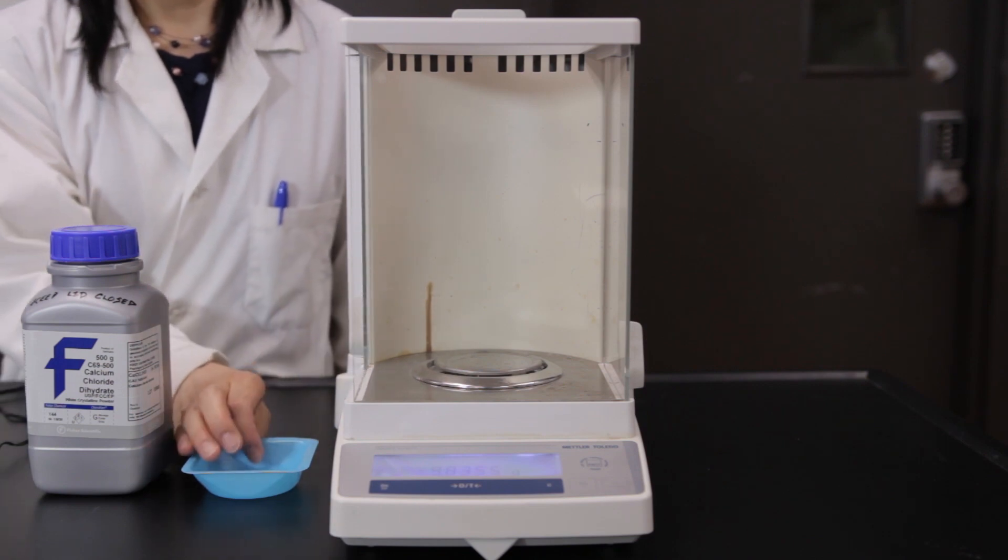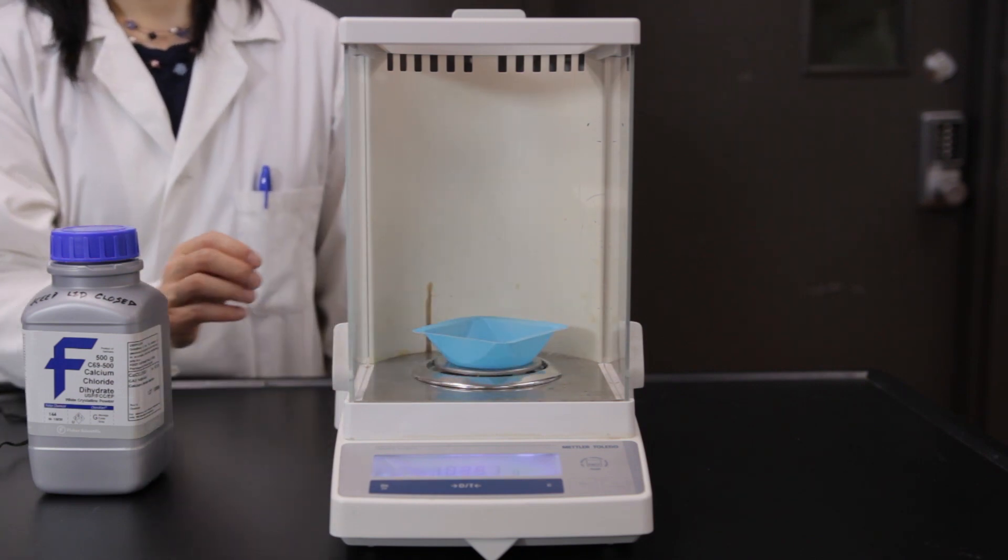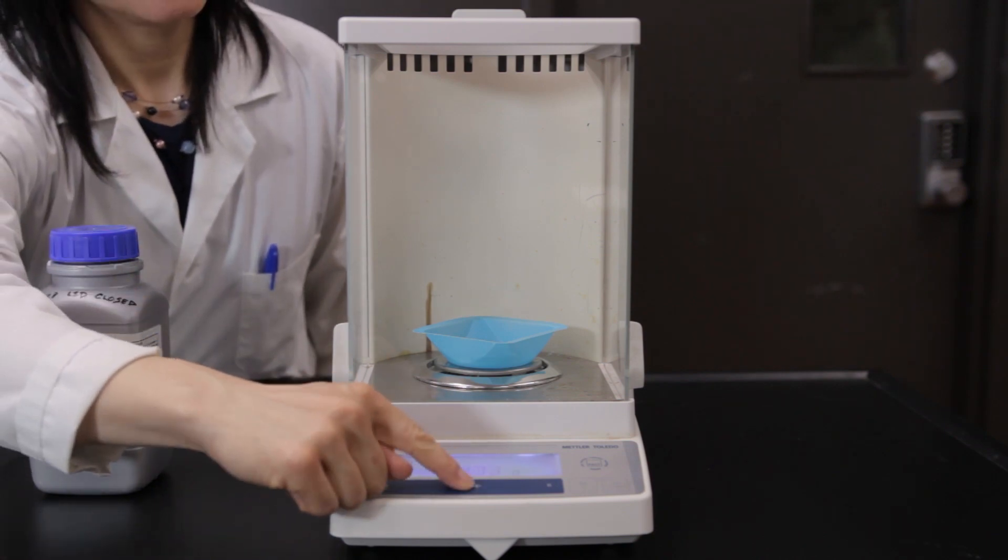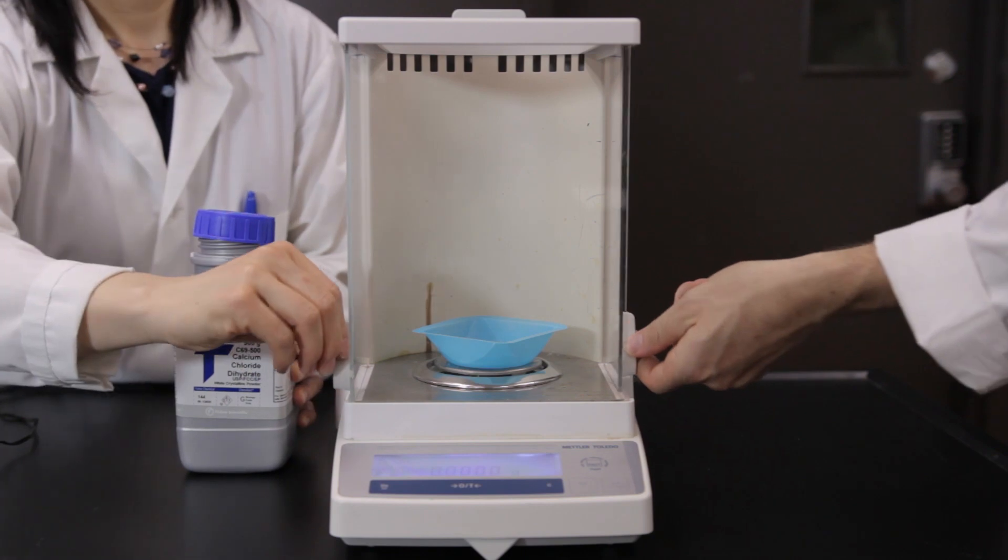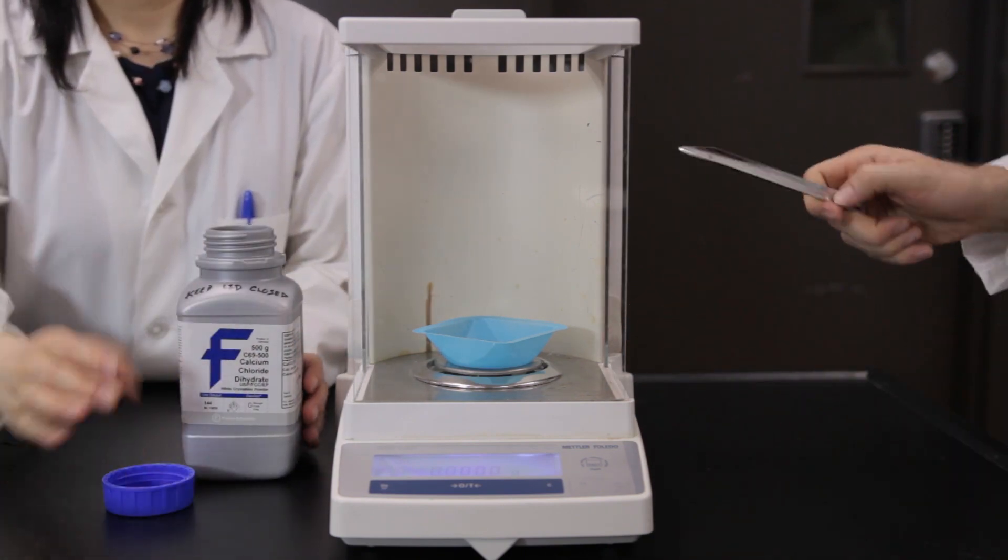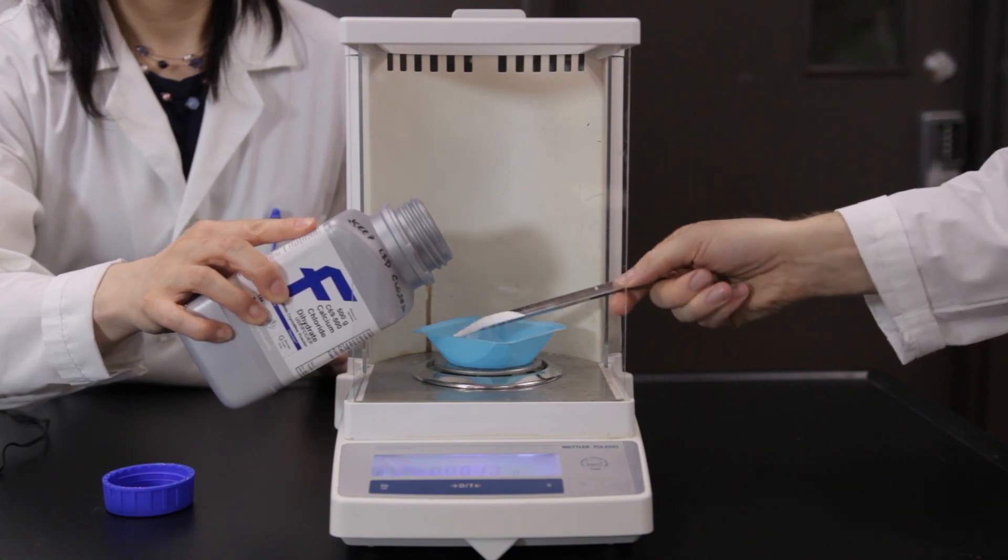Place a weighing dish on a balance and tare it. Weigh approximately 4 grams of calcium chloride dihydrate and record the exact mass.